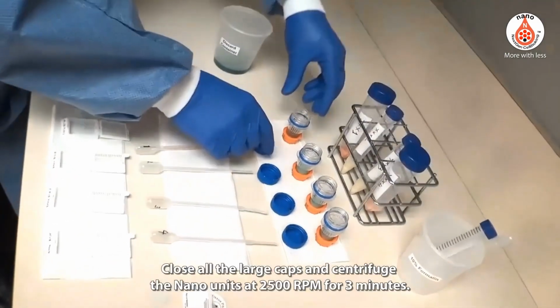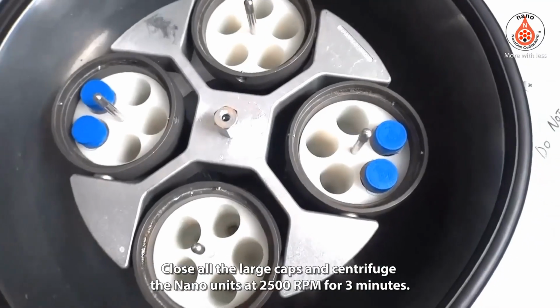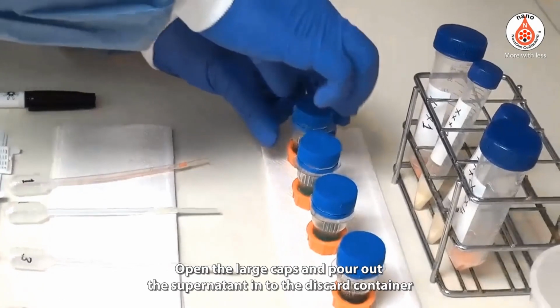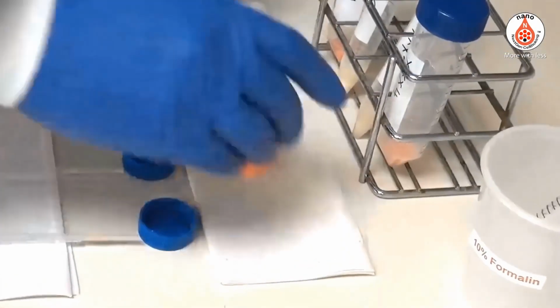Close all the large caps, and centrifuge the nano units at 2500 rpm for 3 minutes. Open the large caps and pour out the supernatant into the discard container.